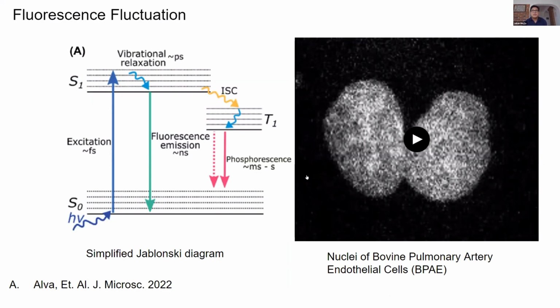For instance, there are new techniques like STED microscopy, one of the microscopes that Tobias mentioned, that are really fancy, and fancy unfortunately means expensive. So most of the labs around the world don't have access to that. So there is another approach, which is processing the information statistically.